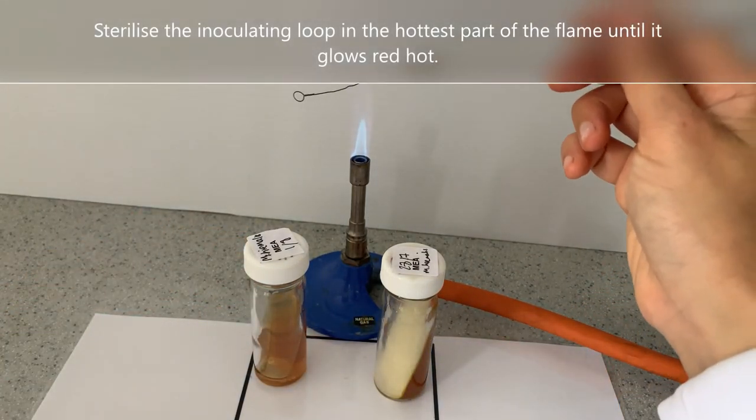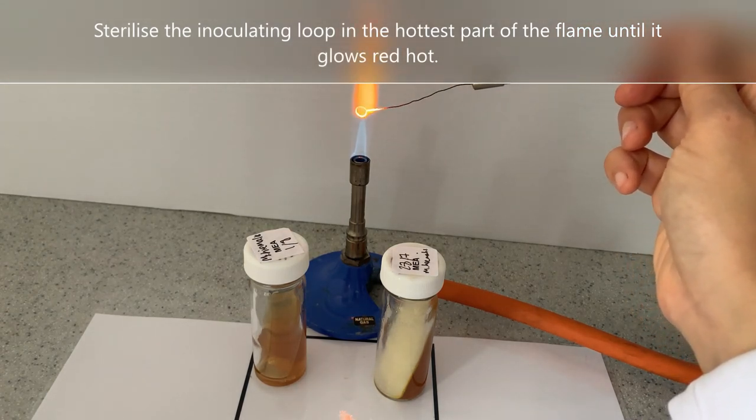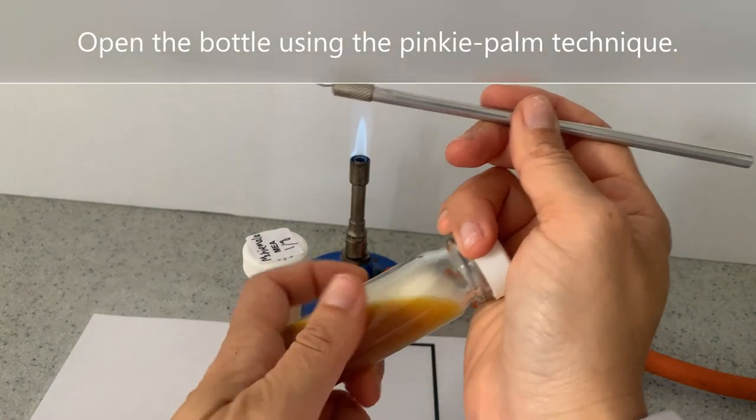Sterilise the inoculating loop in the hottest part of the flame until it glows red hot. Open the bottle using the pinky palm technique.